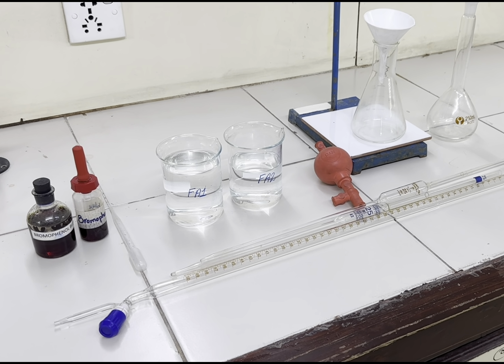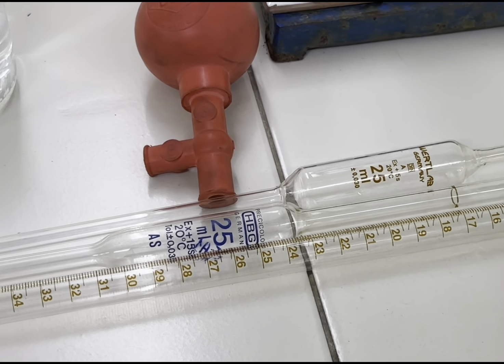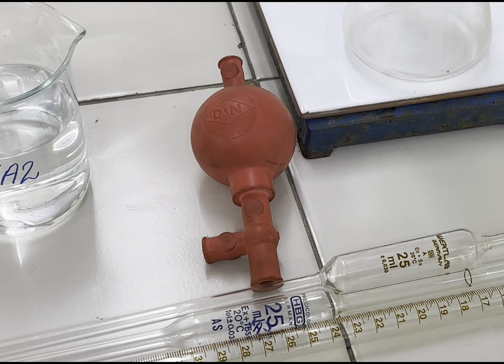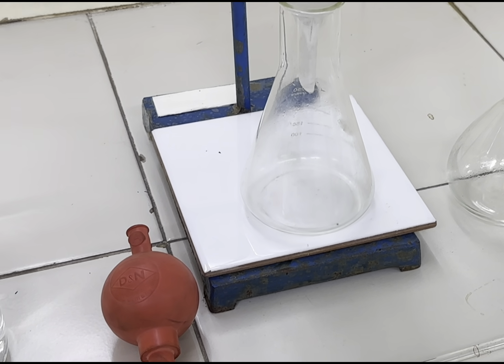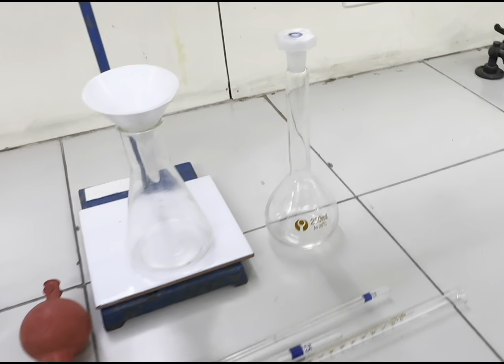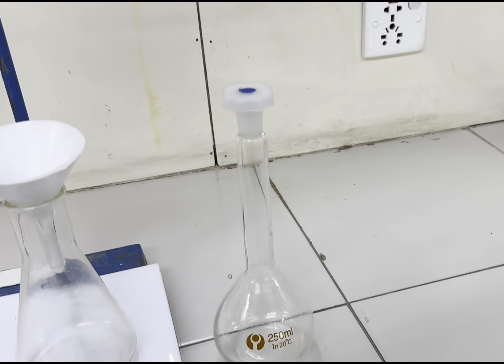Apparatus and chemicals given for this question include a burette, a volumetric pipette of volume 25 centimeter cube, a pipette filler, a conical flask with a funnel, a white tile and a retort stand, along with a volumetric flask of capacity 250 centimeter cube.